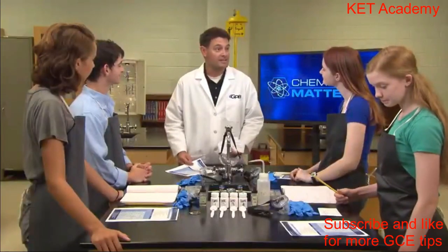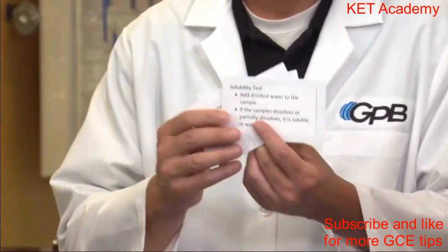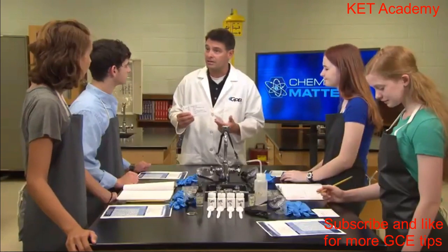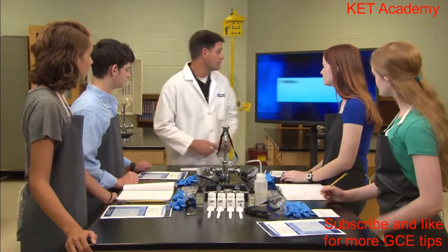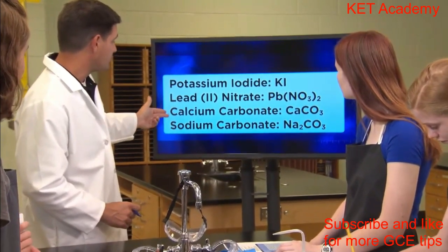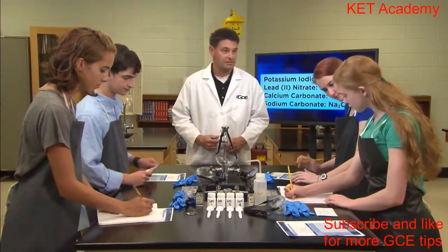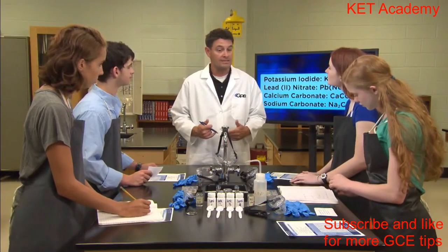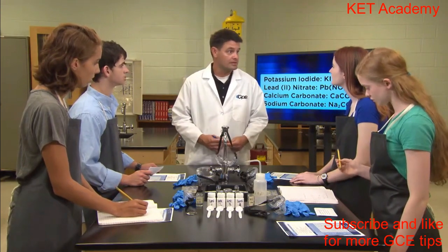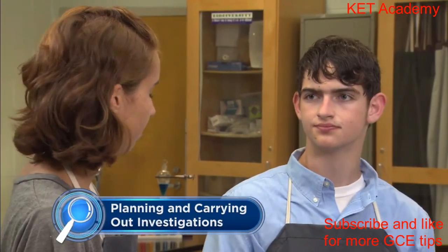In front of you are the 4 samples. You also have a solubility table and a stack of index cards. On the index cards, I've written a different chemical test that you can use to learn about each unknown. The unknown powder samples are lead(II) nitrate, potassium iodide, calcium carbonate, and sodium carbonate. Your first goal is to identify which one is which. Your second goal is to identify the unknowns in as few steps as possible. So I'd like you to work together in your group and develop a plan, but check with me before you begin. Let's look at the different tests and figure out what they can tell us.